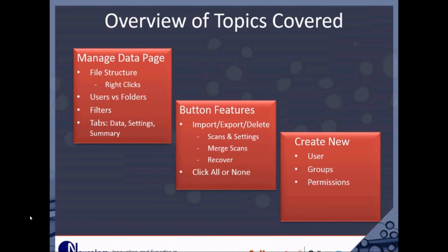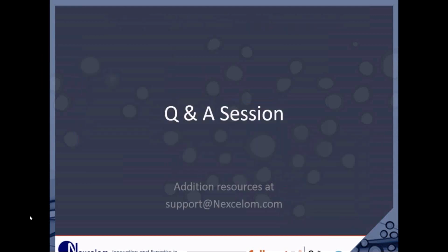Okay, so we've covered a lot today. It's basically how to manage your data better, and an understanding of the file structure, of what users versus folders are, how to use the filters to find your data fast, how to import, export, merge and delete data, and also how to create users and give permissions. It's really useful to get educated on this and then also share it with some of your people so that they can better manage their data as well.